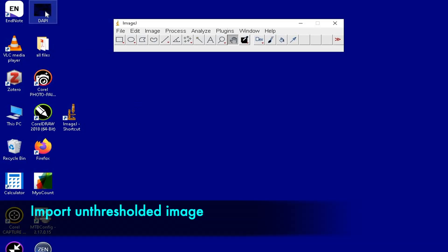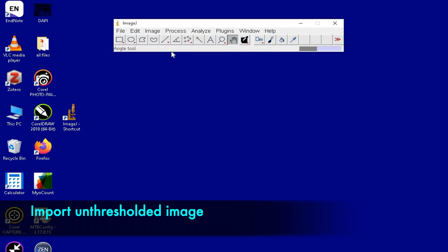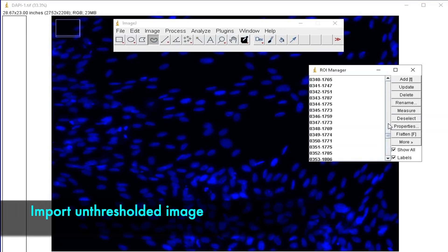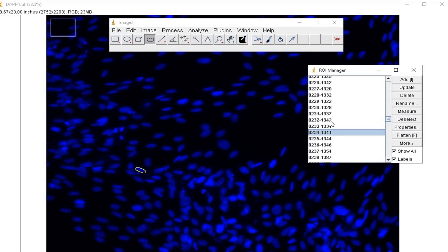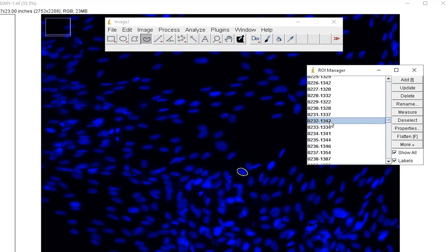Now, import the original untresholded image into ImageJ, and pull up the ROI manager dialog box.